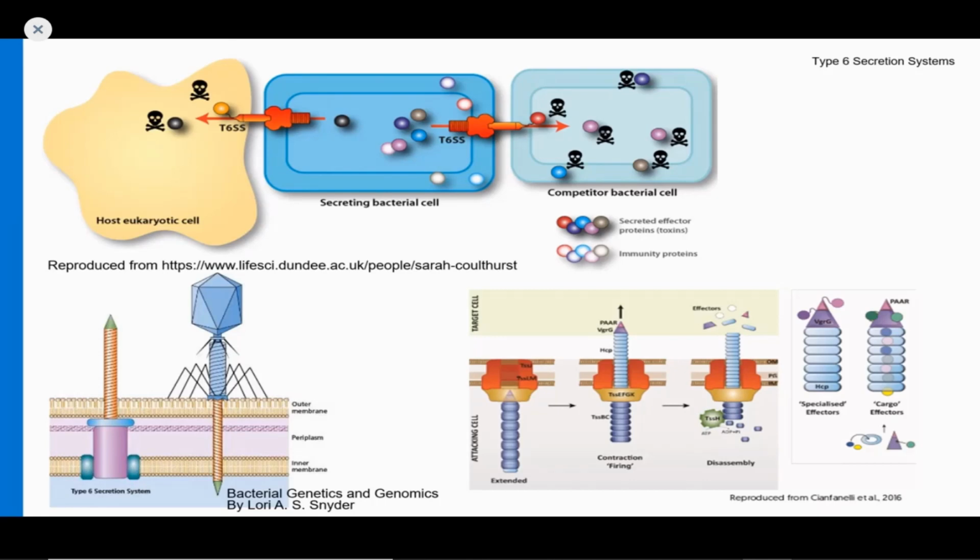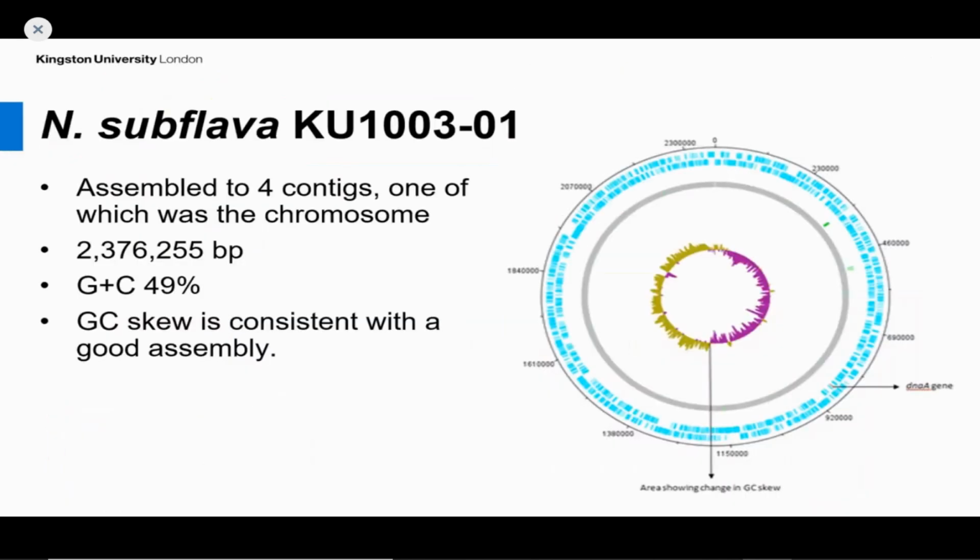So we sent away our strain to have the MinION sequence done, and then we received our sequence back as a complete bacterial circular genome. So we're also excited to get this back as one complete contig, one contig of the bacterial sequence, one circle.